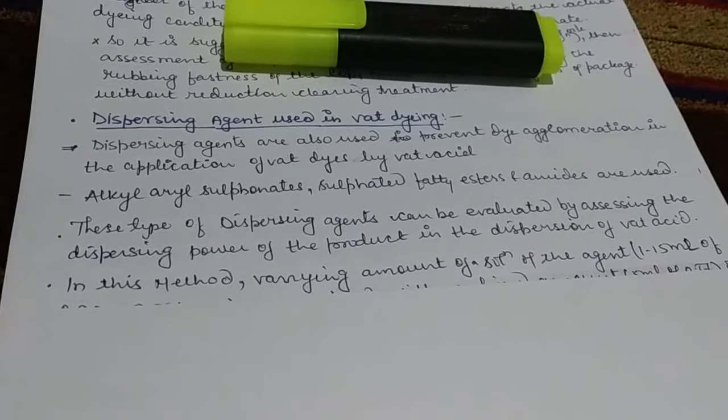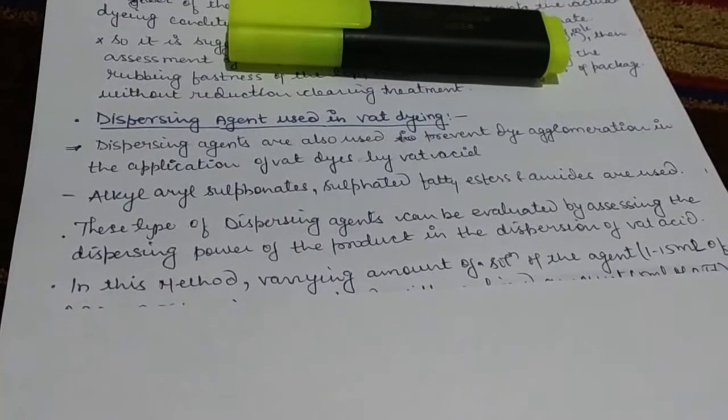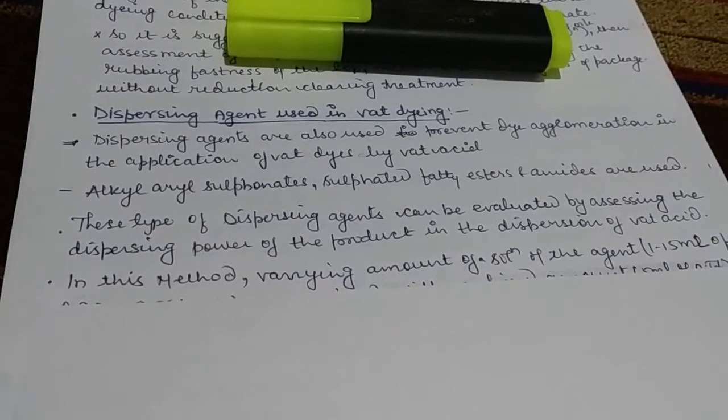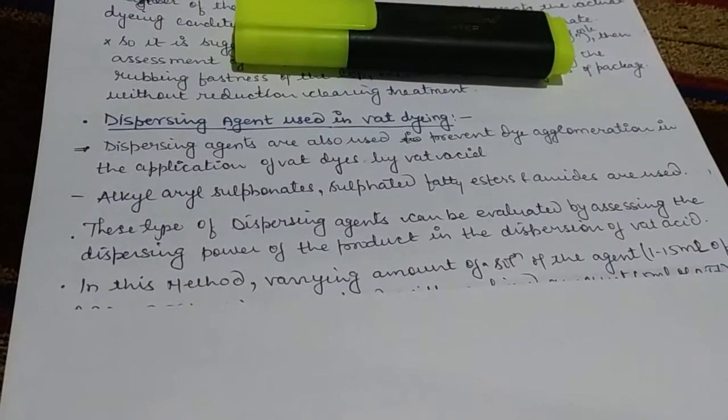So here we evaluate the efficiency or dispersion power of dispersing agent used in vat dyeing in conditions as close as possible to the vat dyeing process.